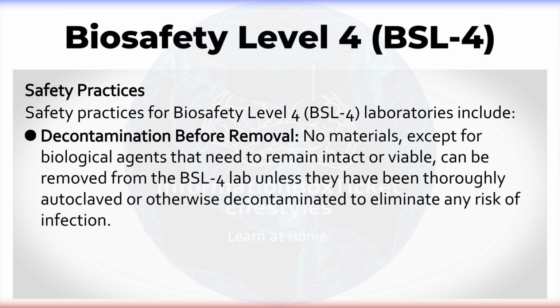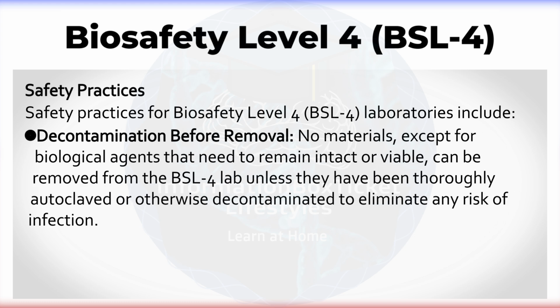Decontamination before removal. No materials, except for biological agents that need to remain intact or viable, can be removed from the BSL-4 lab unless they have been thoroughly autoclaved or otherwise decontaminated to eliminate any risk of infection.